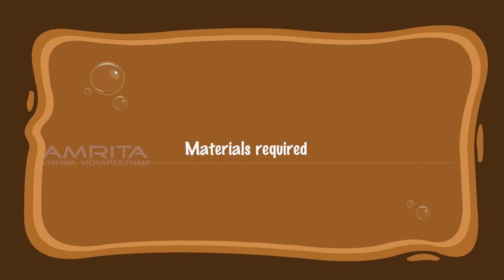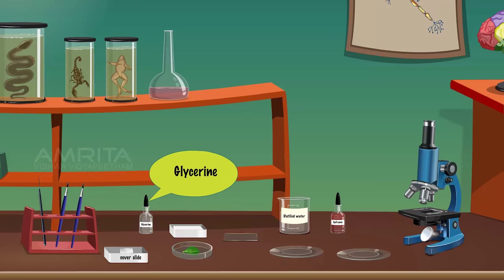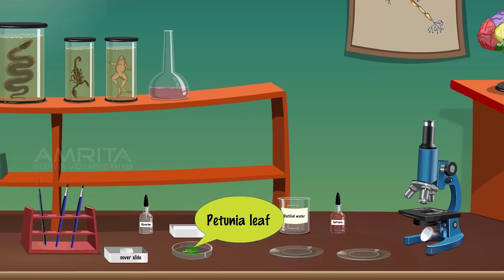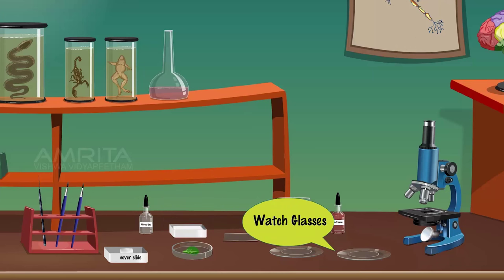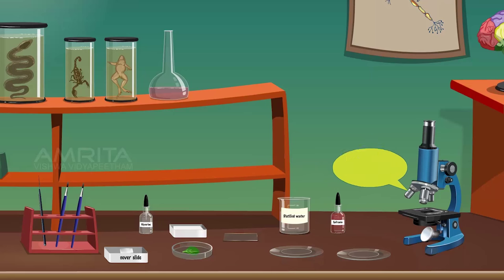Materials Required: needle, brush, glycerine, cover slips, filter paper, fresh leaf of Petunia, glass slides, watch glasses, distilled water, safranin solution, and compound microscope.